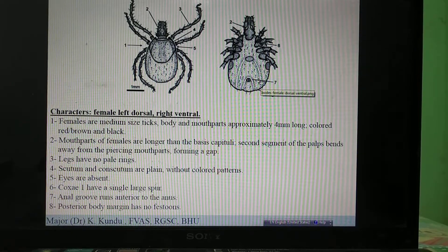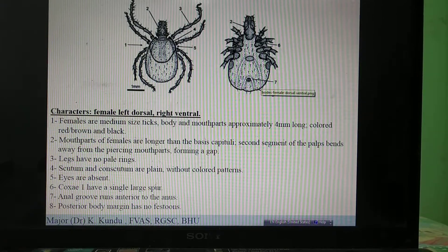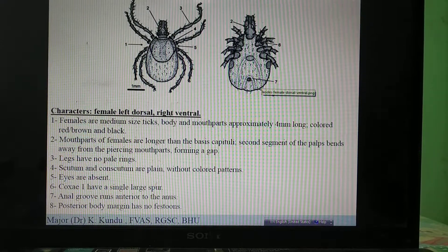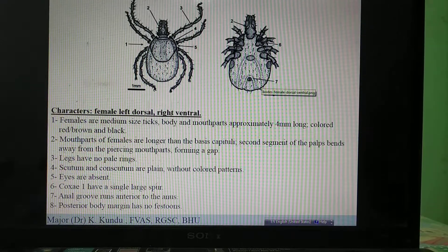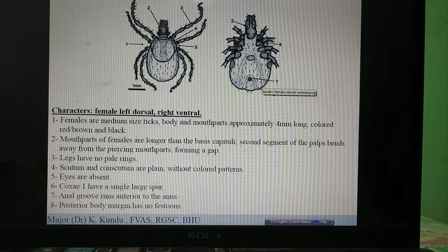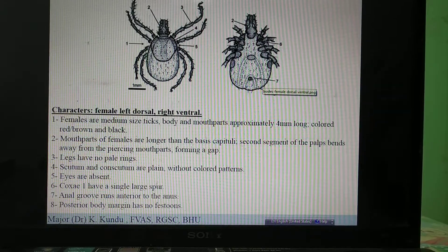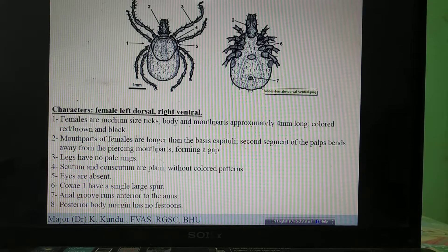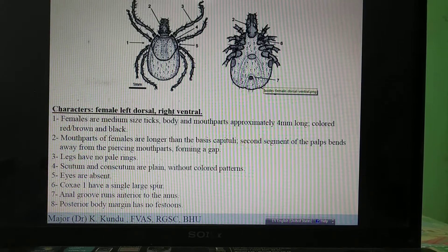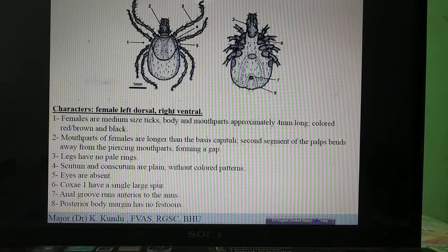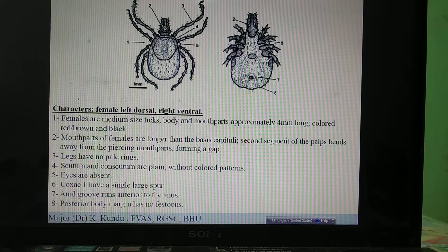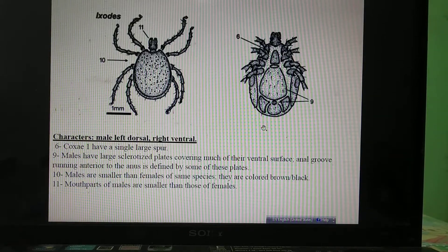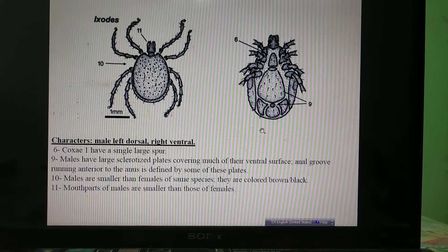Ixodes is the only genus that has an anterior anal groove. All other genera — Rhipicephalus, Haemophysalis, Hyalomma, Dermacentor, and Amblyomma — all have a posterior anal groove, whereas Ixodes is the only genus with an anterior anal groove.